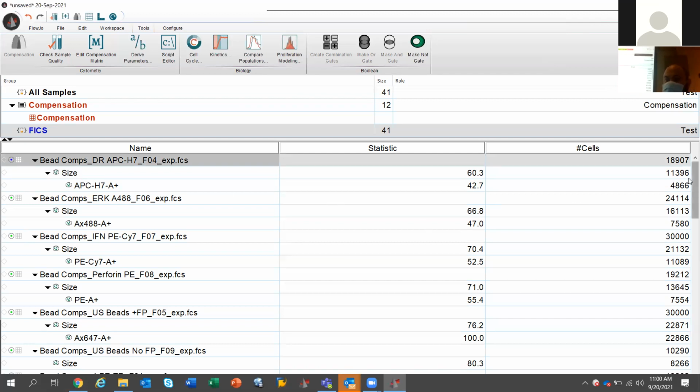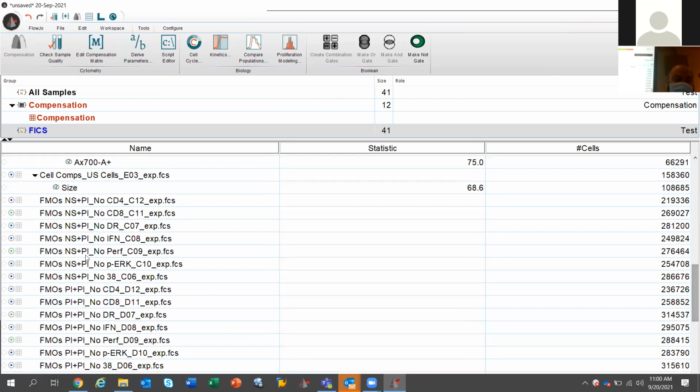Not the circle. It's just that one is better than the other. So you have when the sample quality is valid and it's okay, meaning that it's still good, but it's not great. And if you hover over the blue, then you get okay, but it's even better. But with both of them, you're still in good shape.